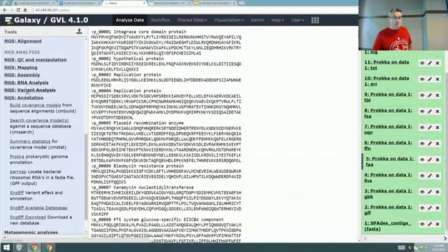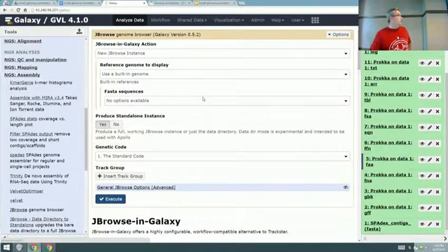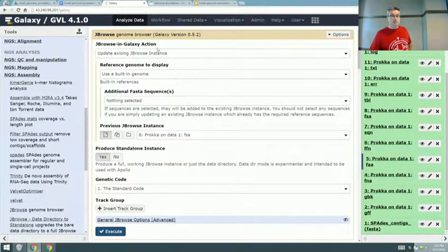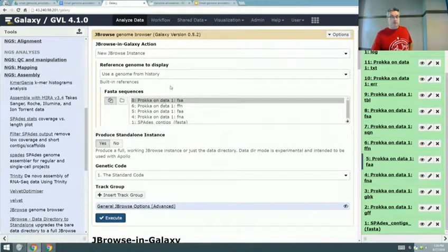There's an open issue that I don't produce FRN, which is all the RNA features, the non-coding RNA. So I was just going to, no, we won't do that. I just want to show you what they look like when we build them.